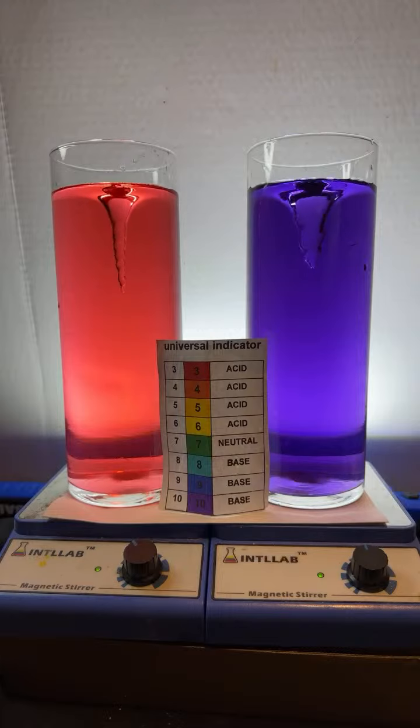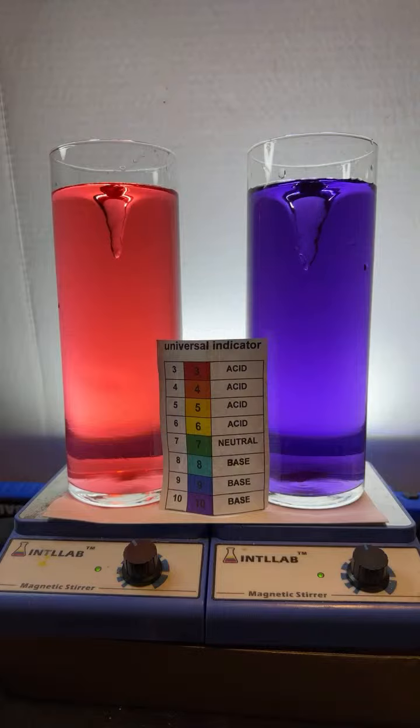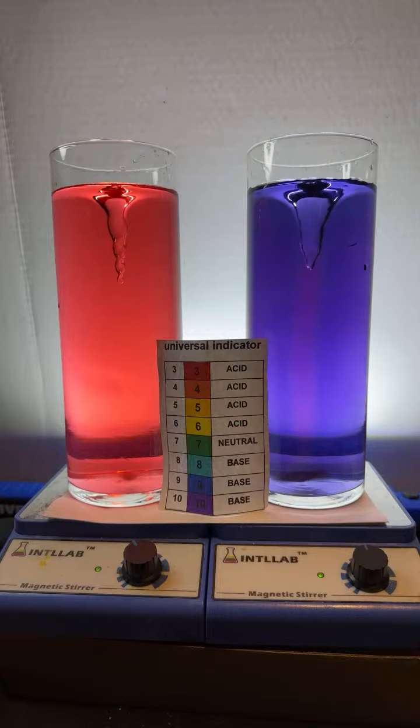I'm going to try to get this neutralized. It's not the easiest thing in the world. I'm going to try to add half a drop. You notice I had just a little drop right there. In it went. And now you can see, let's see where that ends up. Kata is studying this right now.